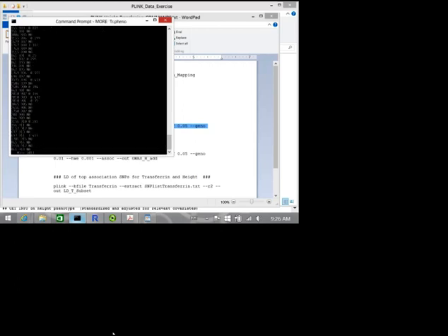This is the transferrin phenotype, with family ID, individual ID, and then these values. So what does NA mean here? It means no information, no phenotype. This file you're using doesn't look like the one I have. Yeah, it's my file, but you have the data.